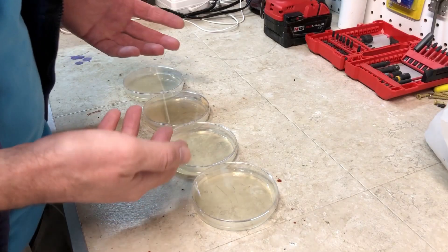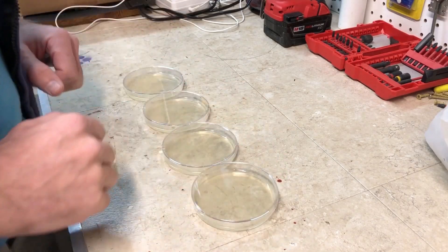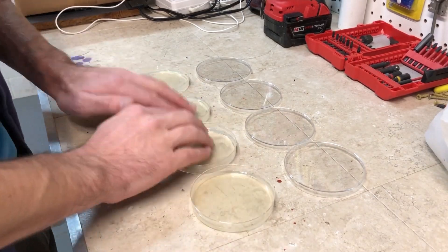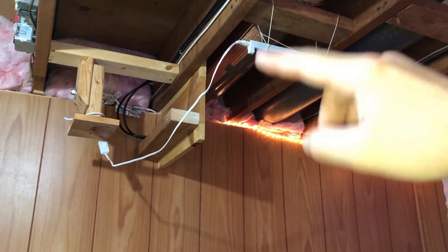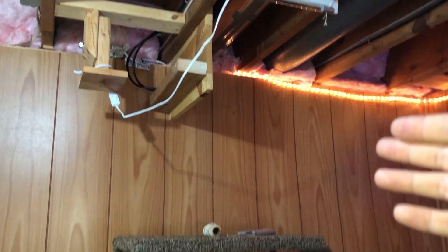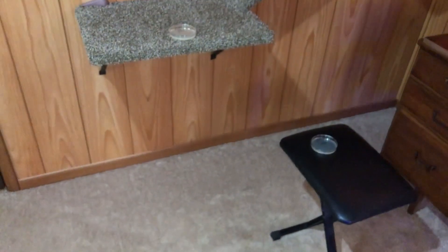My hands haven't been washed all day, so they're as germed up as they can be. I'll open these up and touch each one evenly. Now that the dishes are all germed up, I've hung this UVC light on the ceiling area of my studio. I've placed these dishes at different spots — closest, medium distance, and furthest on the floor — basically to demonstrate proximity and what somebody might do when they bring a UVC light home.